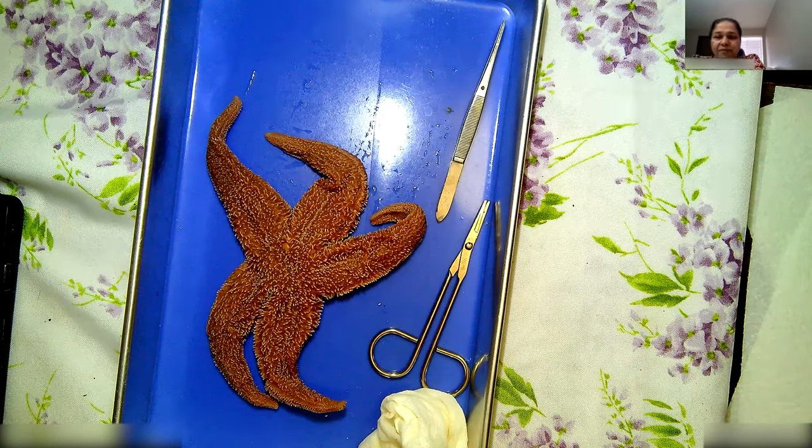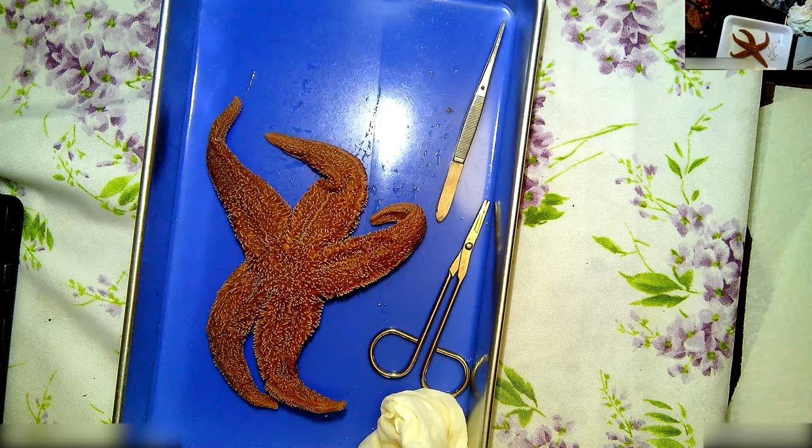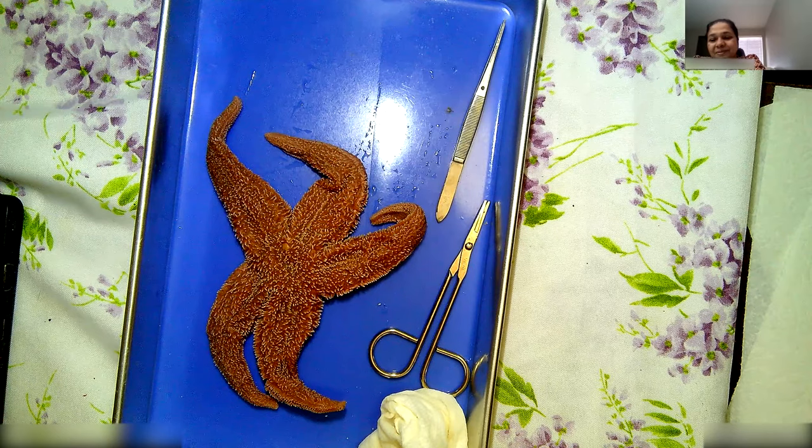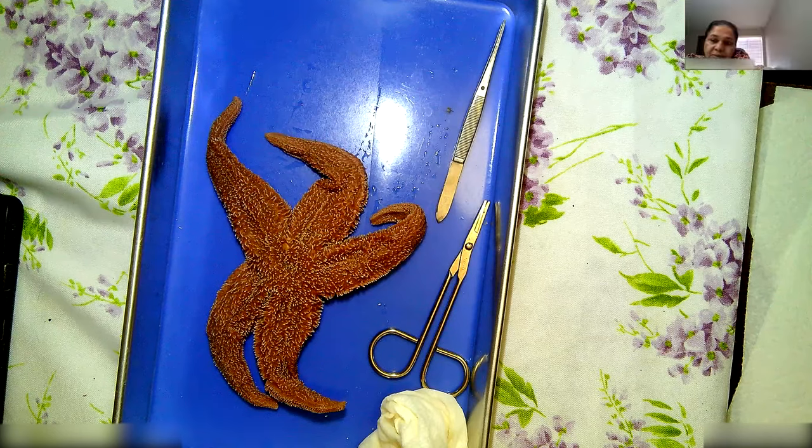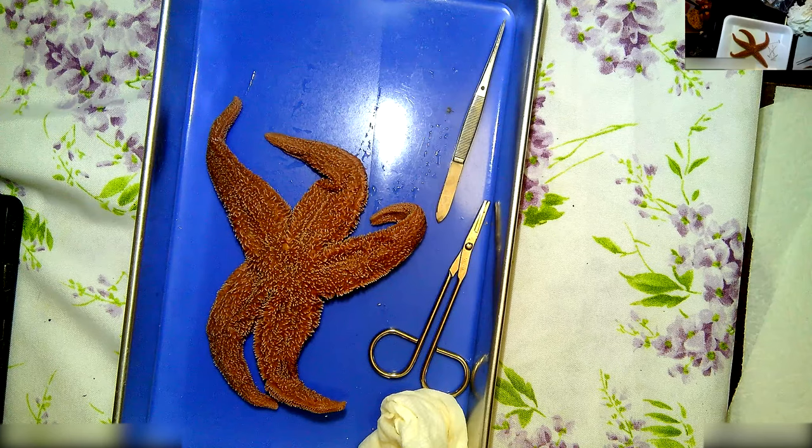As soon as you guys do the dissection, I would like you guys to share your thoughts and what you learned. Estefania, do you have your specimen? I like Rocio's setup. Jesus is getting set up. I think we're almost there. Val's coming back. Taji Hutchinson? I think they're not back yet. Lizette's still working. Pat it dry, guys. Let's give it a minute.